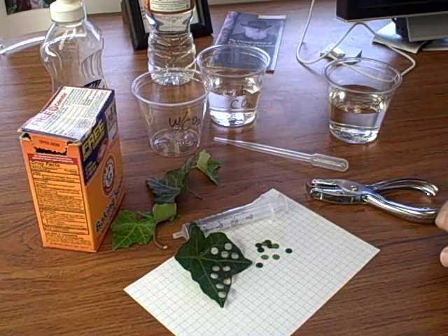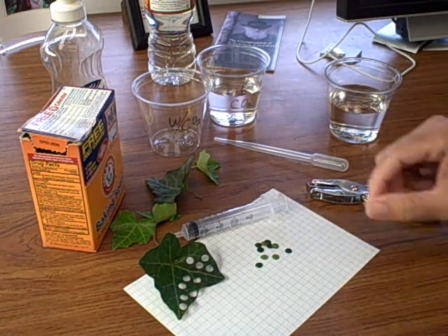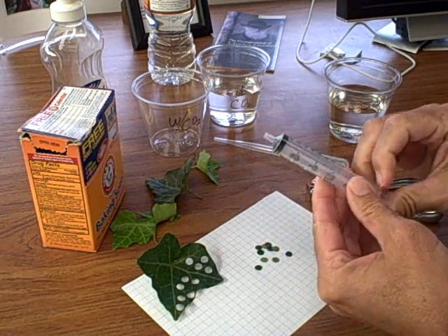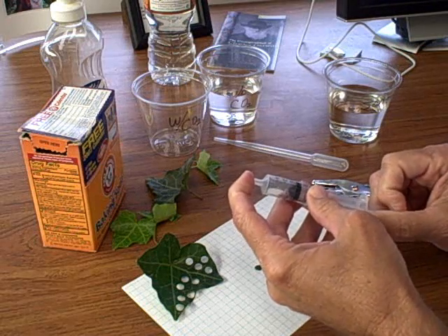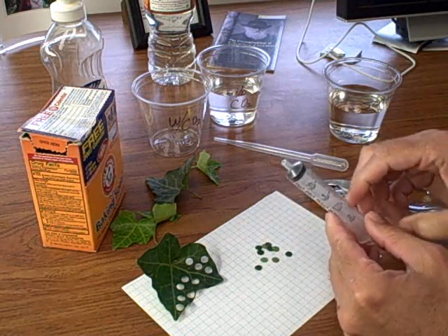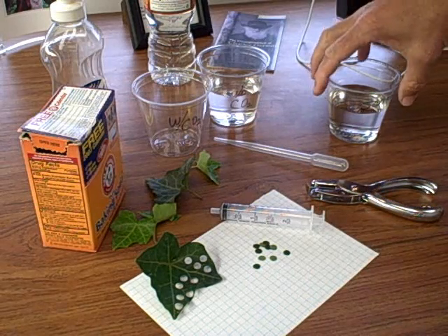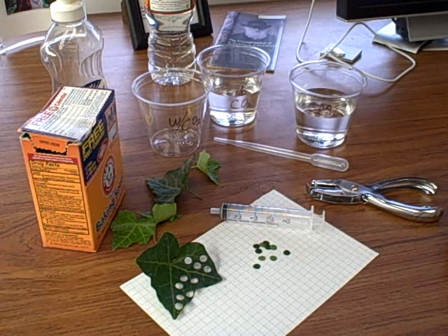On the AP Bio list last night there was a request for help on trying to get leaf discs to sink for the floating leaf disc assay. I presented some ideas of why their discs might not have sunk, and I thought I'd produce a short video that summarizes the whole procedure of the leaf disc assay.